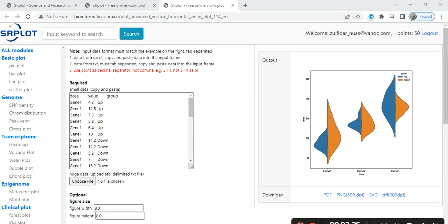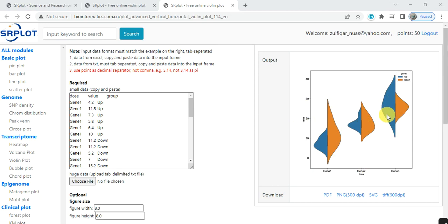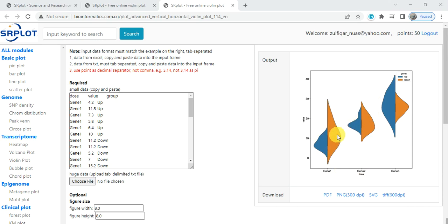When you click on submit, it gives us that plot. This is the gene 1, this is the gene 2, and this is the gene 3.